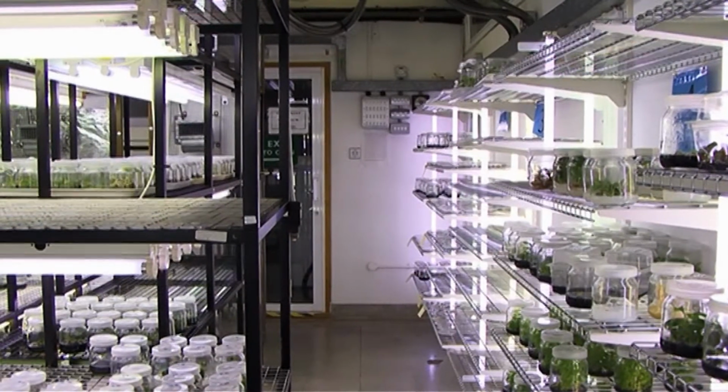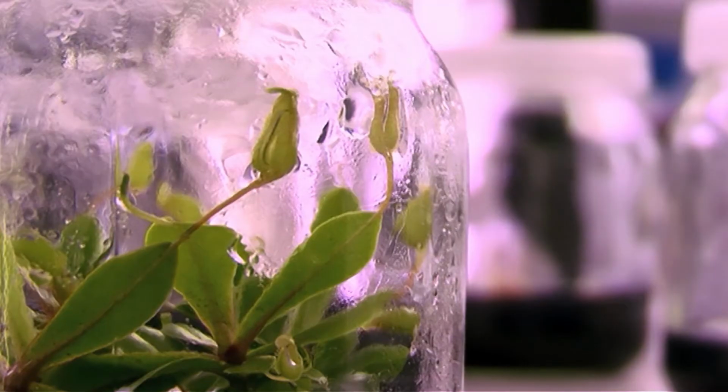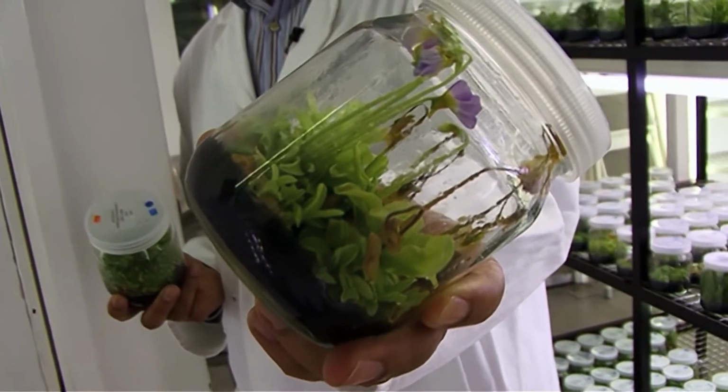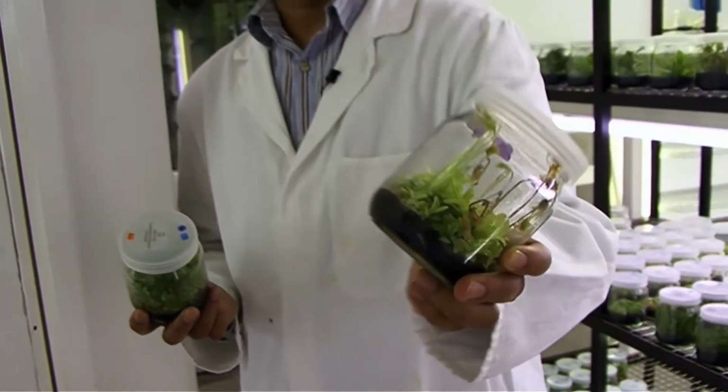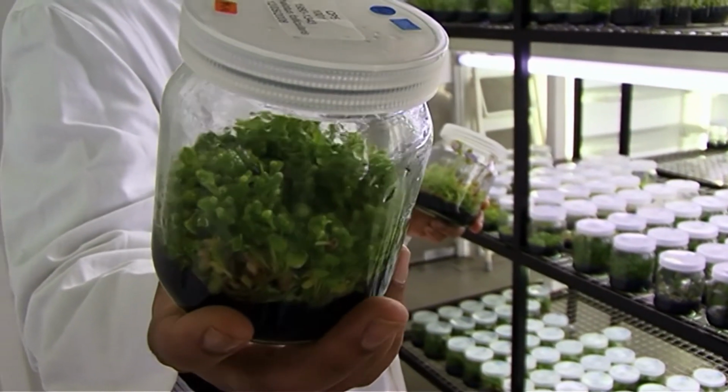We have got around 60 to 70 species of plants, which all have a very high conservation rating according to the World Conservation Union. But we are trying to grow more plants in culture and eventually store them in liquid nitrogen. Some of those plants are extinct in the wild, or the last plant remaining in the wild, or critically endangered. That means maybe only 10 or 15 or 20 plants left in the wild.